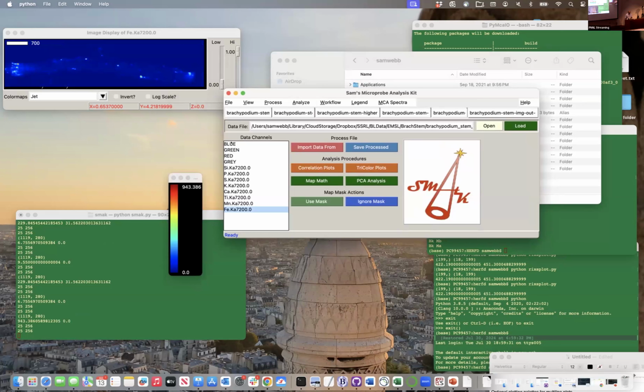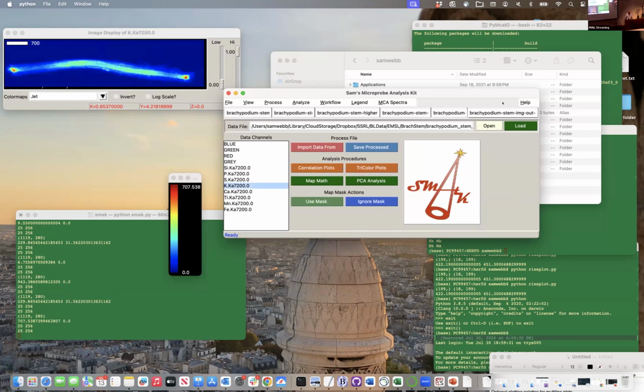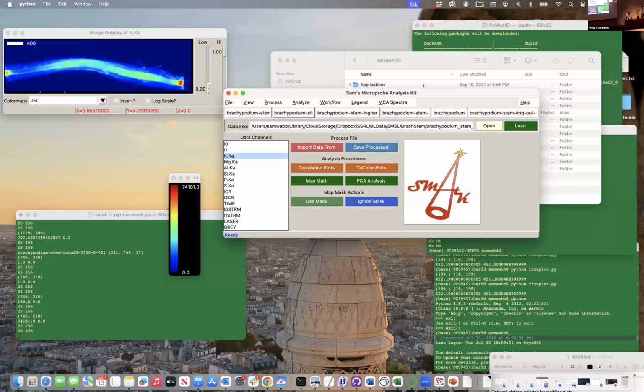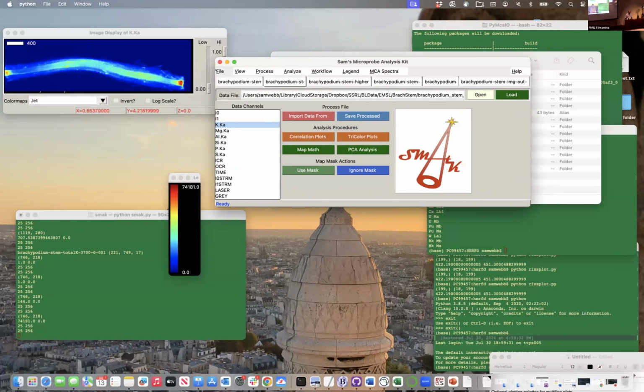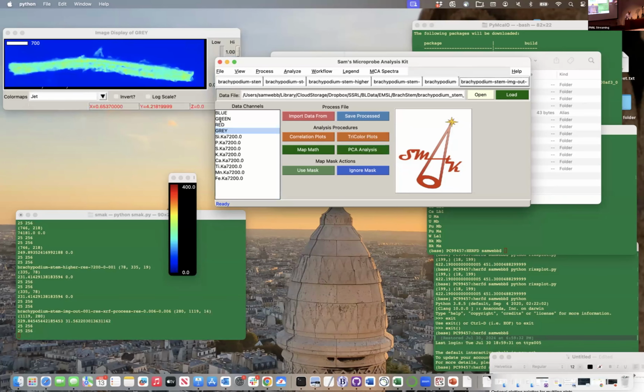Here we are with the 7.2 data onto an image, and it does match up. I'll go through that process with the two data sets rather than that image. Here we are with this one. There we go. We have plot markers for both of these. We can try it with the image. Yeah, this will be a good example of how things don't work, because I'm not above showing when things don't work.